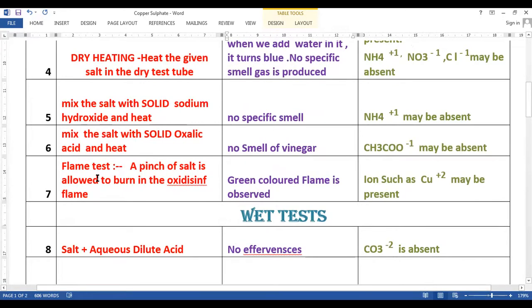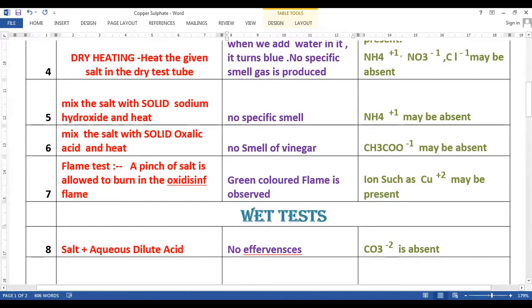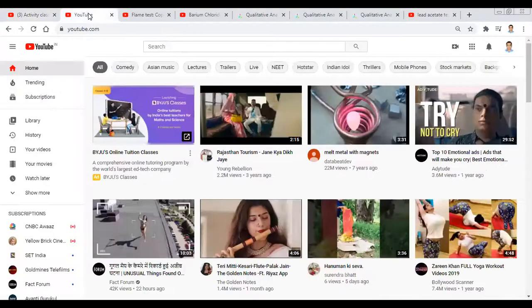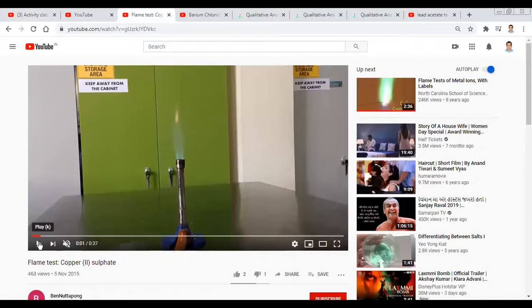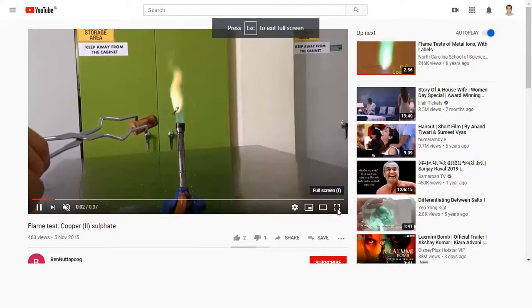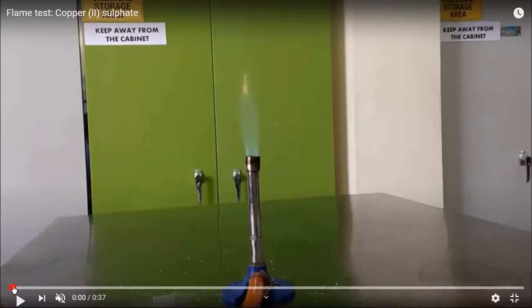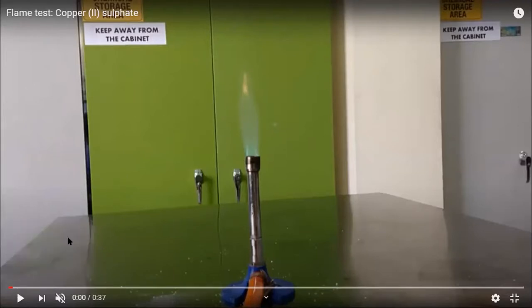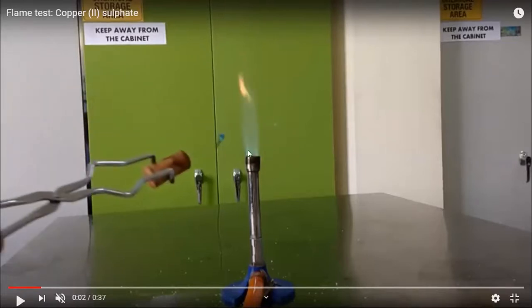Now we have another important test which is known as the flame test. A pinch of salt is allowed to burn in the oxidizing flame. Let us see what happens when we perform the flame test. You can see that we have a flame now — this is what is known as the oxidizing flame. We shall take a pinch of salt and allow it to burn.